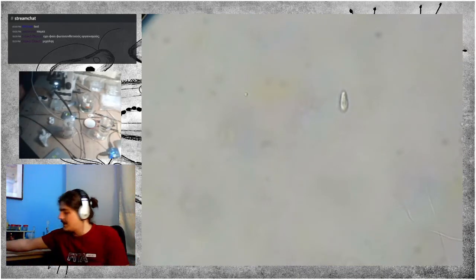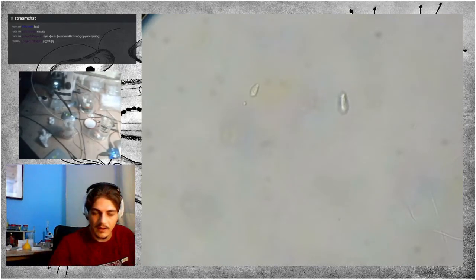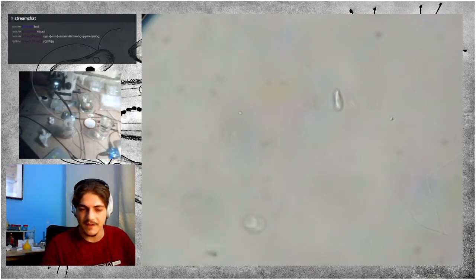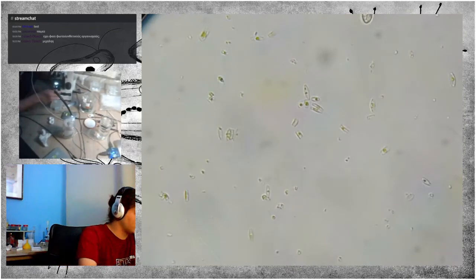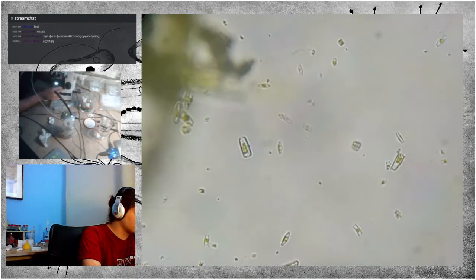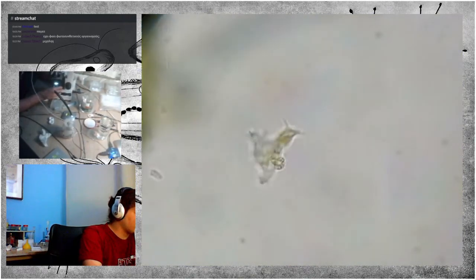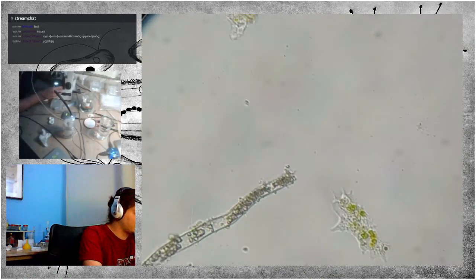No, unfortunately, there doesn't seem to be any specific example of the organism that was there, from the ciliate, I mean. And here are a few amoeba.